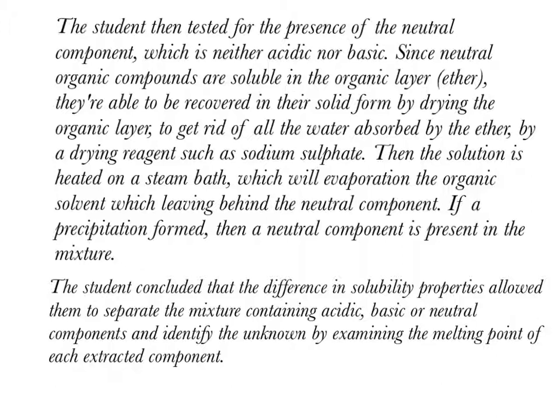The student then concluded that the difference in solubility properties allowed them to separate the mixture containing acidic, basic, or neutral components and identify the unknown by examining the melting point of each extracted component.